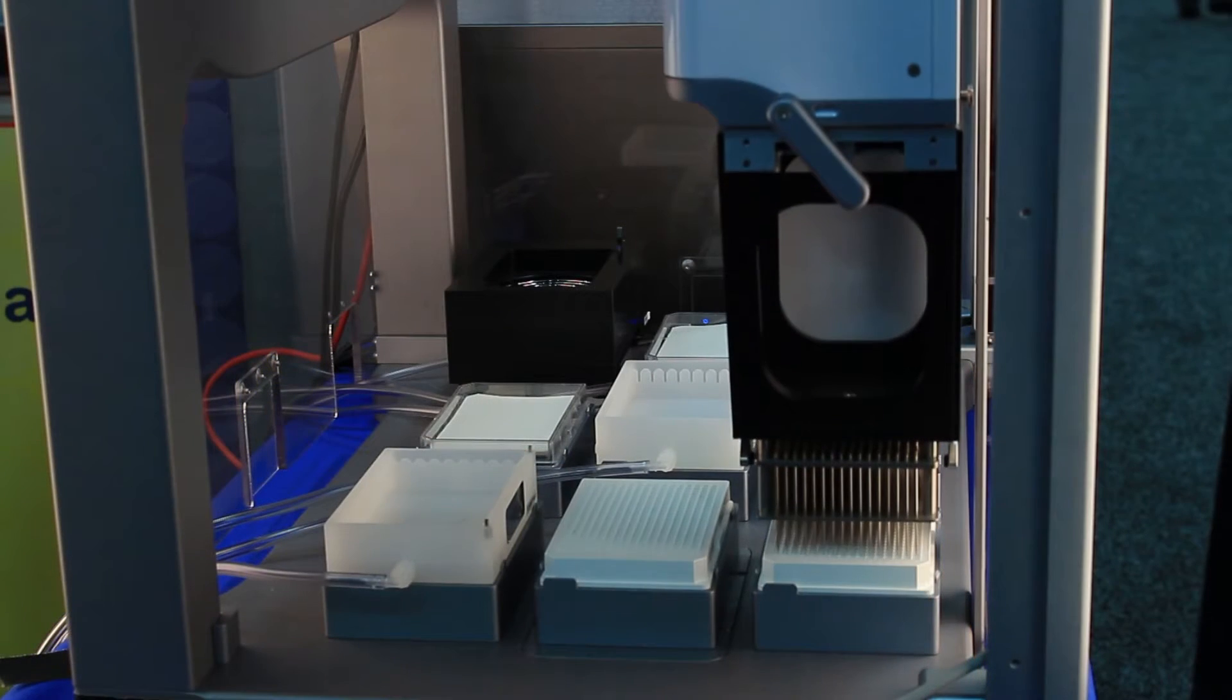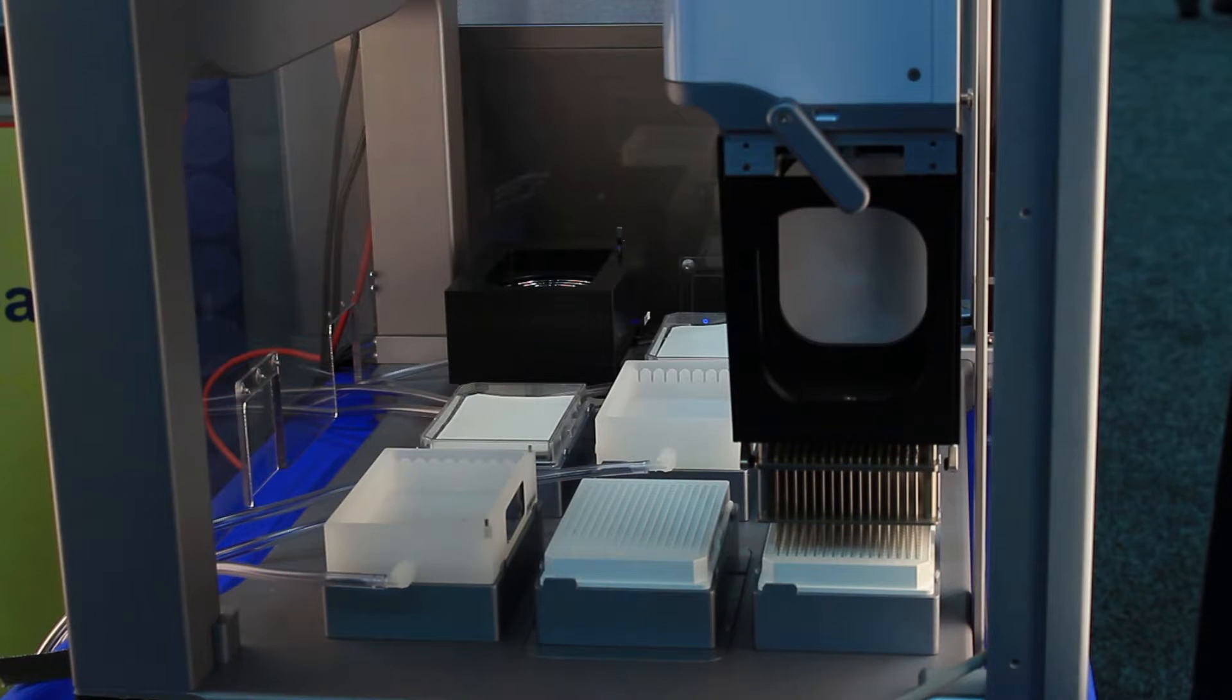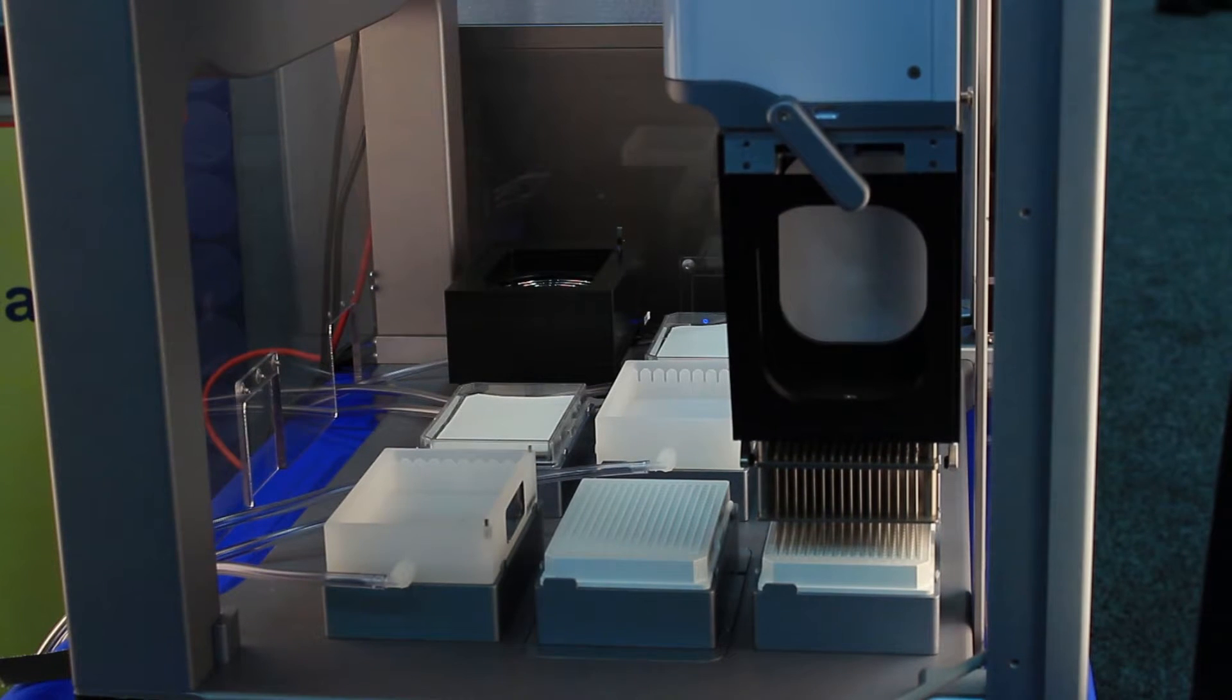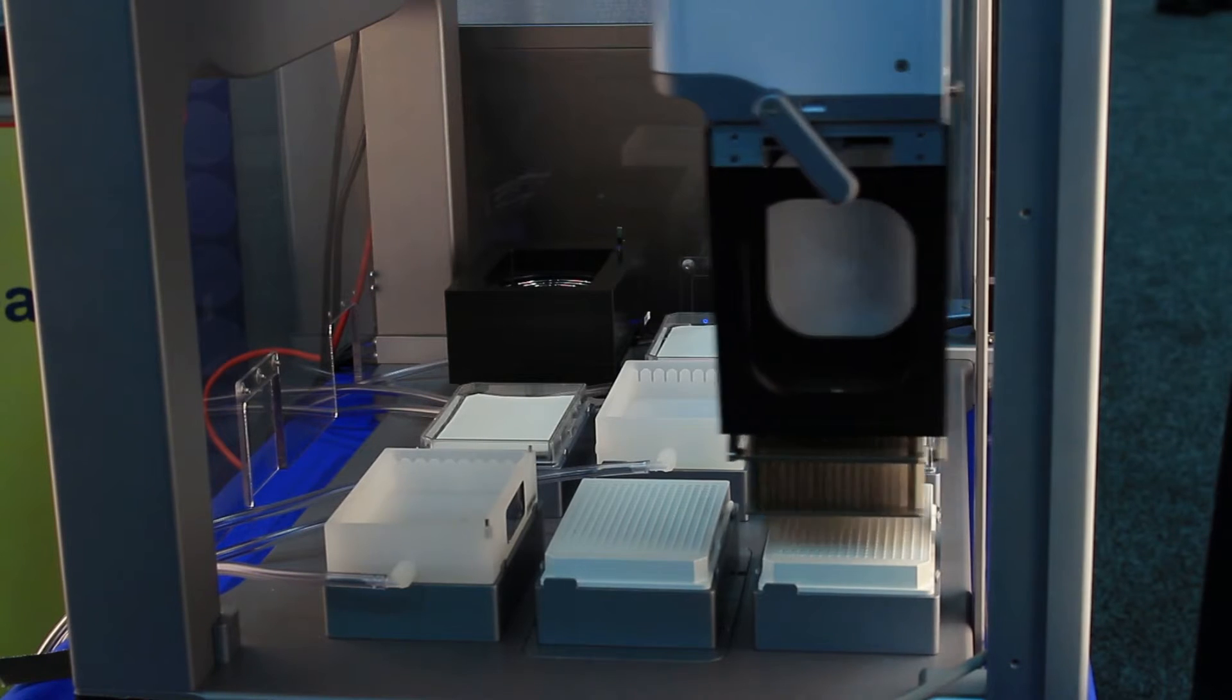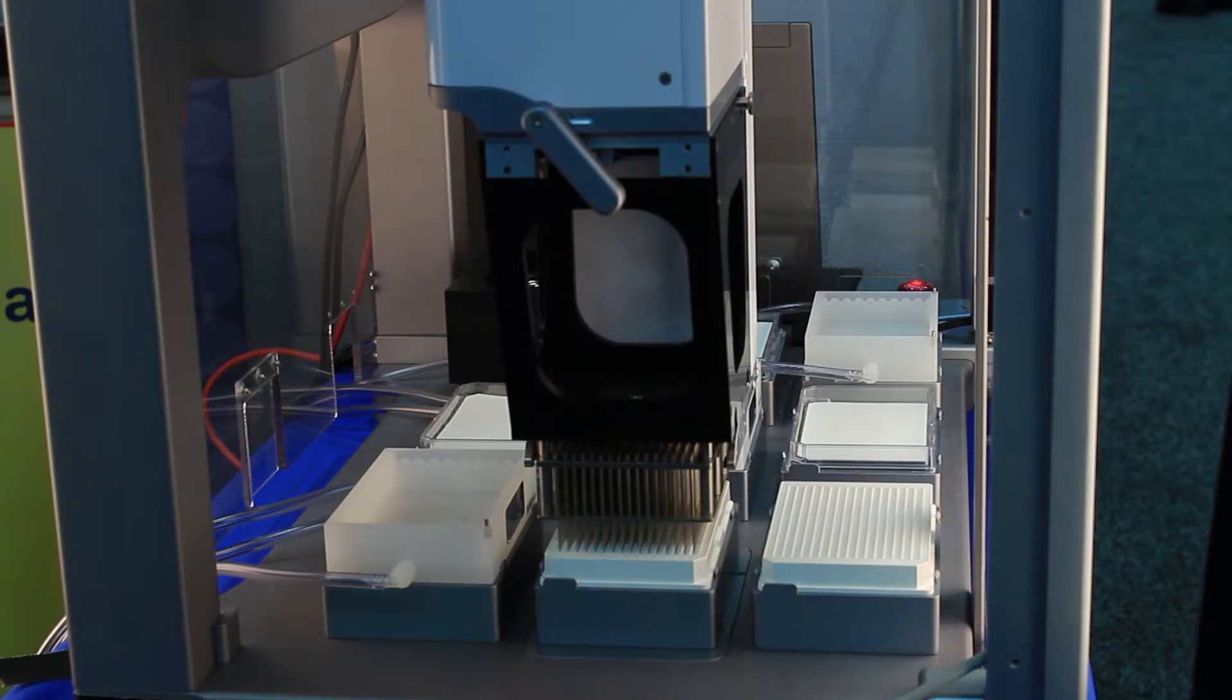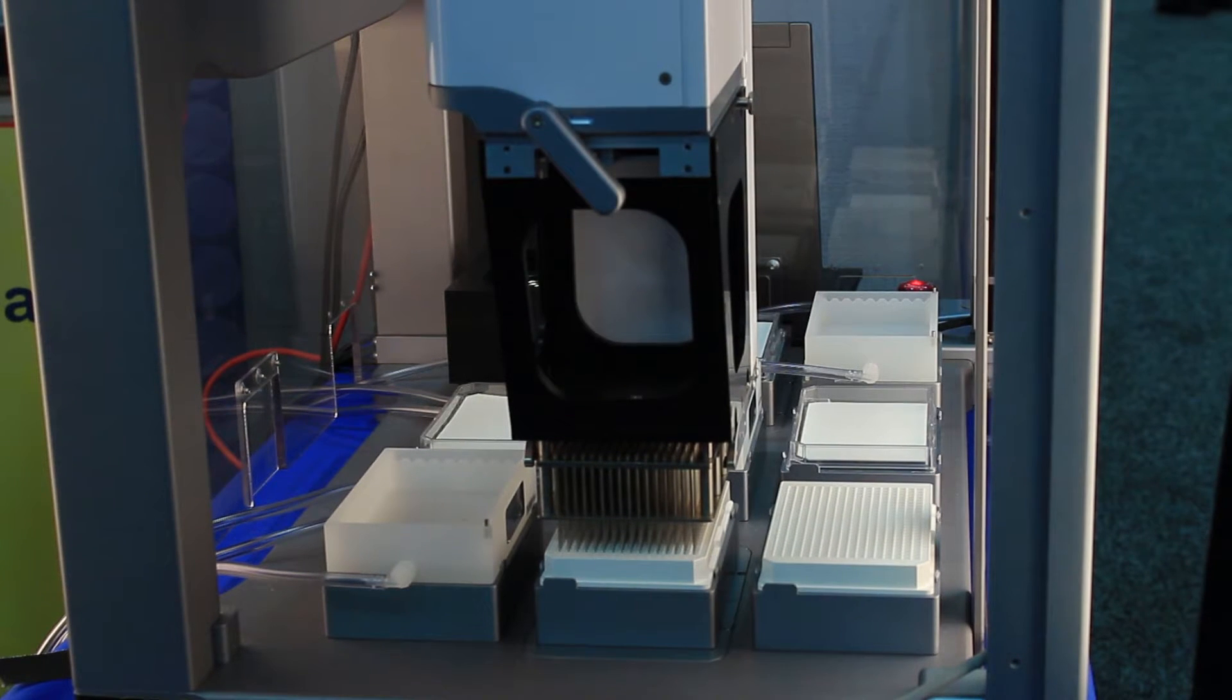First the pin tool is dipped into the source plate three times. Dipping three times ensures proper coating of the pin. Next, the liquid from the source plate is transferred into the recipient plate, again dipping three times.